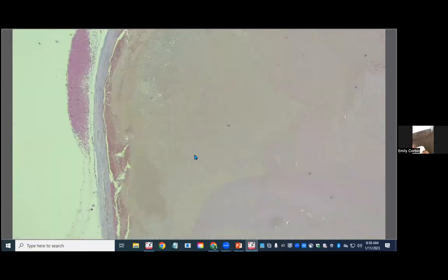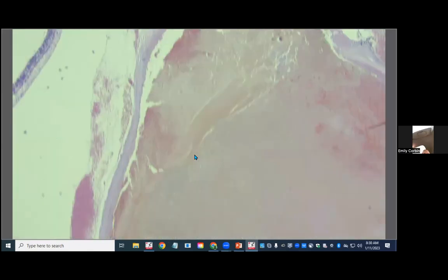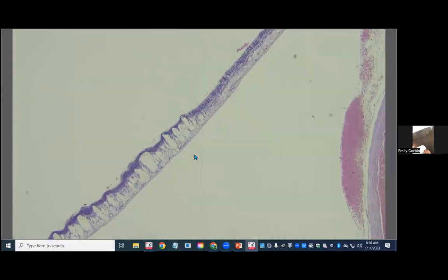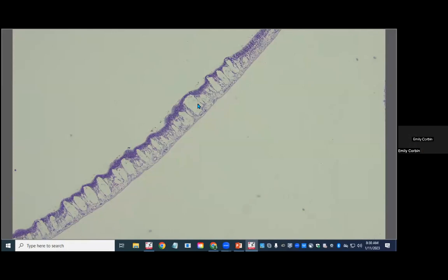So that's what we've got. We've got a huge posterior lens defect with a postlenticular membrane. We do have that retinal detachment. This is a good example of retinoschisis briefly. So you see these gaps multifocally between the nuclear layers. Something that can happen when there's been traction on the retina or just as a result of chronic retinal detachment, when it sits detached like this. So retinoschisis, an interesting lesion to point out.